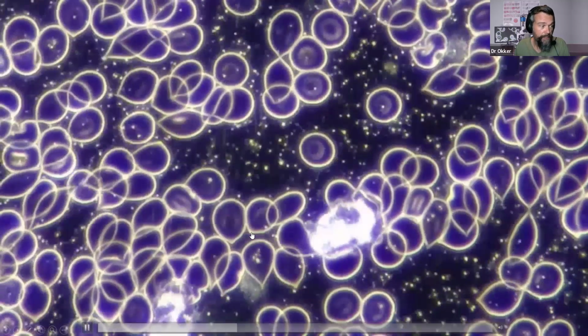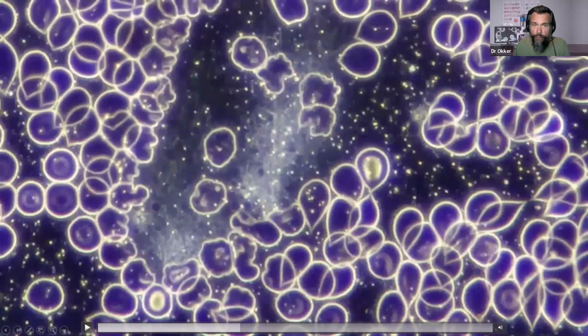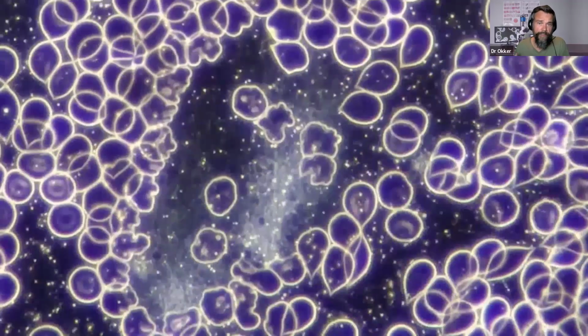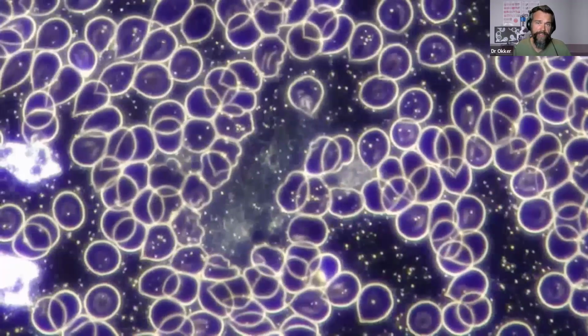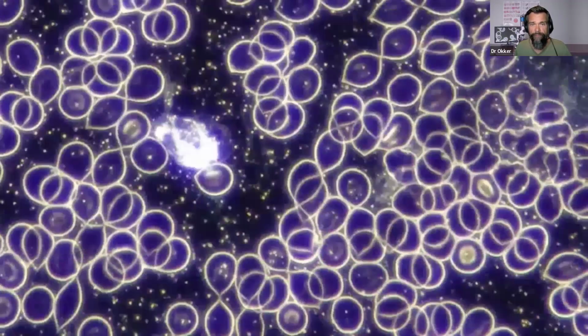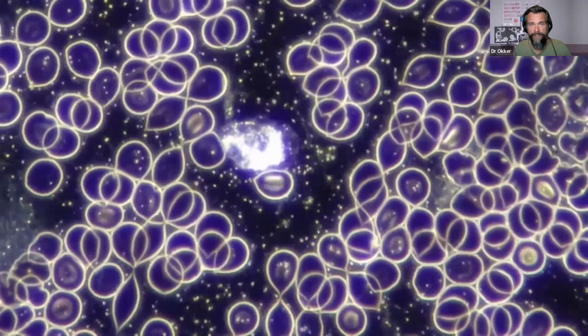We can see these white blood cells there as well. All these abnormal shapes towards the left here are cloud patterns indicative of inflammation. Again, a very sensitive indicator. We can pick this up with a baseline sort of low level of inflammation in the system, and that's been connected to the development of various chronic diseases. Research in functional medicine has actually shown that inflammation is one of the foundational issues with the development of chronic diseases.